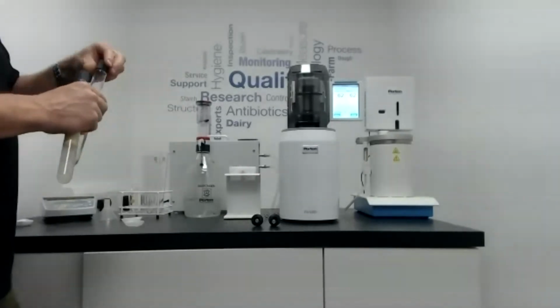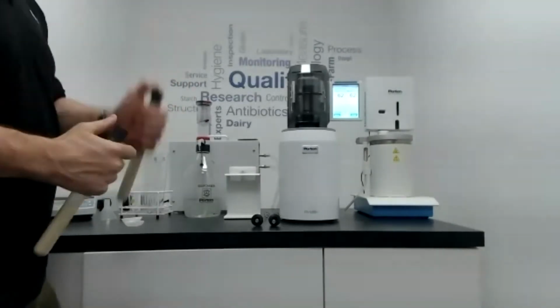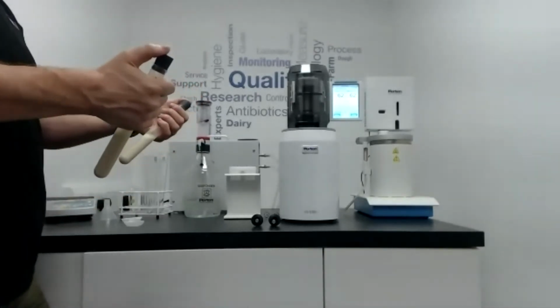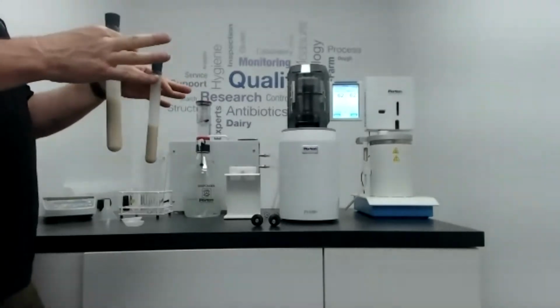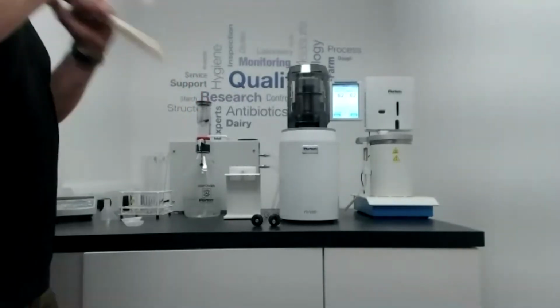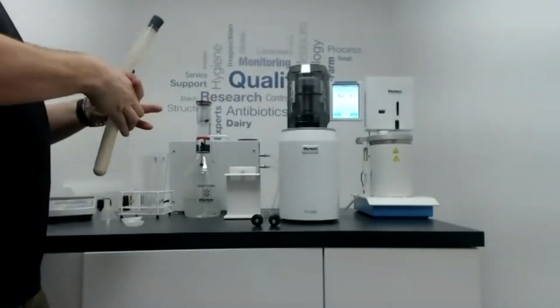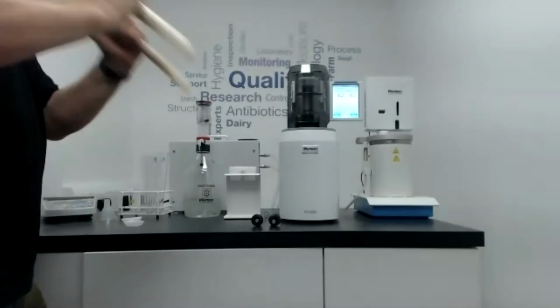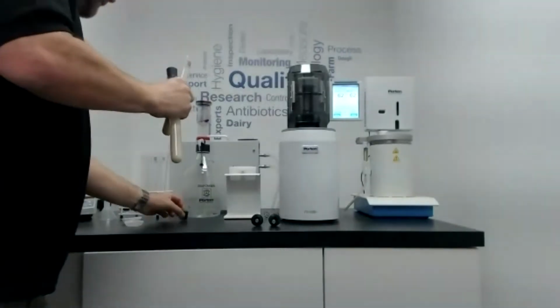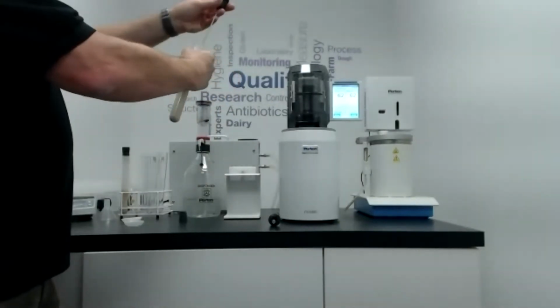Okay, so the method states that you should shake each one vigorously. First of all, we just want to make sure that we've got all the flour mixed in. The method states 40 shakes plus or minus 10. Because I'm doing a double and each hand shakes slightly differently, I'll swap over after 20. So now we need to just scrape down the slurry using the end of the rod.